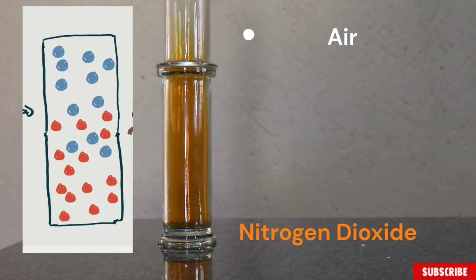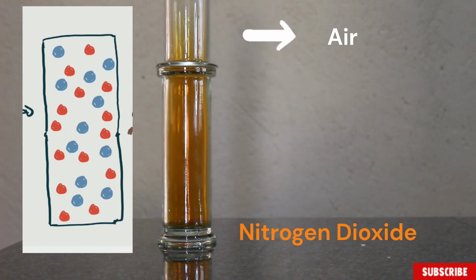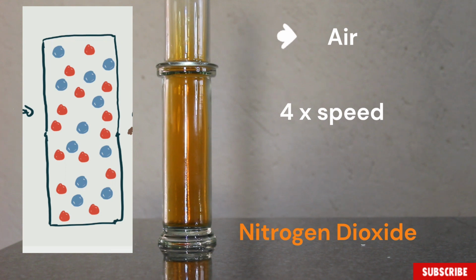So we are going to fast forward this one. We're going to speed up this video from now, because it can take quite long to see the whole mixing of the particles in here. So I'm going to speed up at 4 times what is actually happening here.